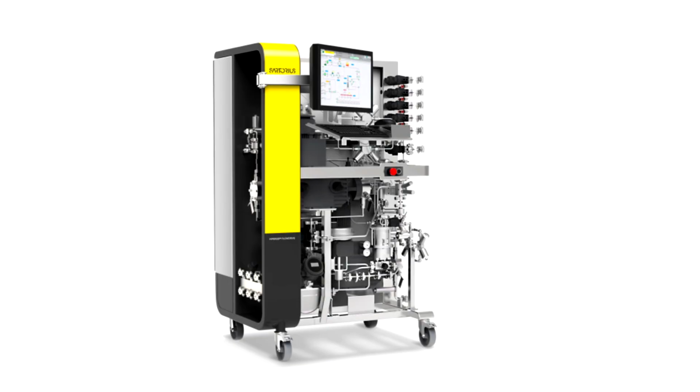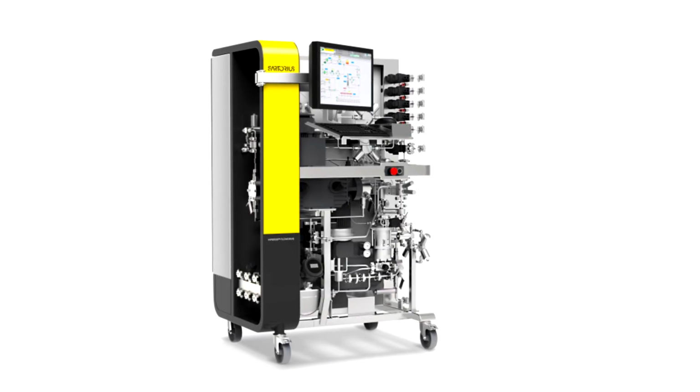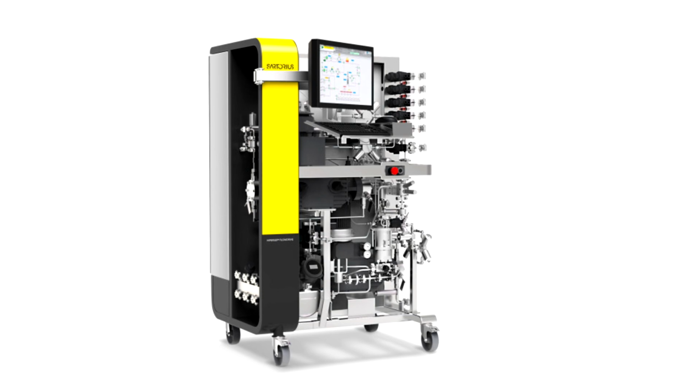There are a number of key steps in chromatography process development. The first step is understanding the chemistry, looking at the kinetics of the target product formation as well as the impurities that are difficult to remove. In the second step, you would want to optimize the chemistry conditions in order to improve the purity of the target molecule, but in particular to address the impurities that are difficult to remove and might require chromatography.